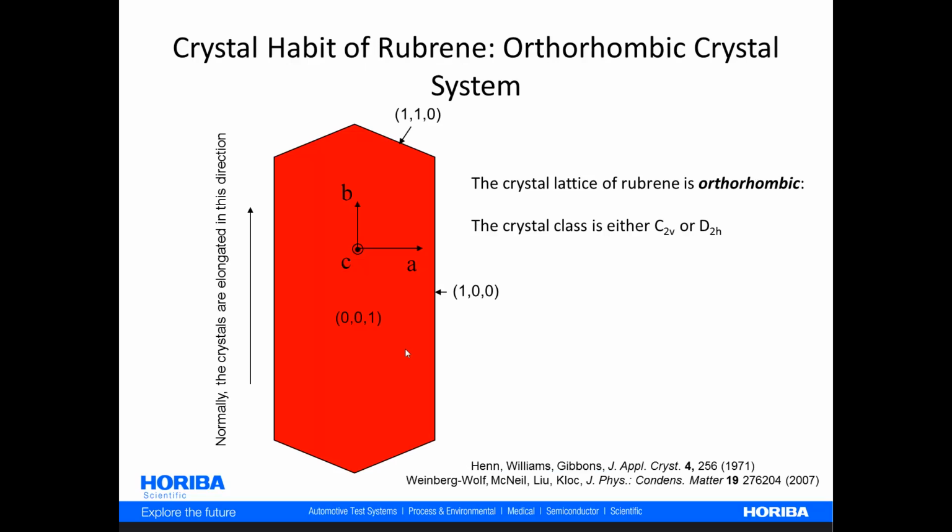However, at room temperature, it does assume the solid state, and generally the crystalline solid state, and the most general forms are in the orthorhombic crystal system, assuming the crystal class of either C2V or D2H, as you see here. Now, generally, the rubrene that you'll encounter, certainly out of the bottle, and that's often fabricated, is D2H crystal class. And so that's what we'll deal with here.